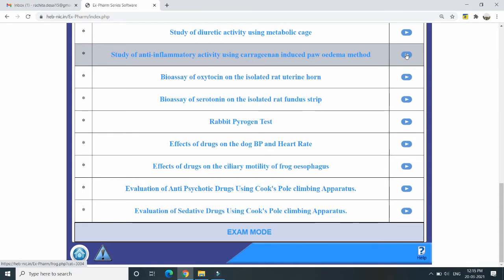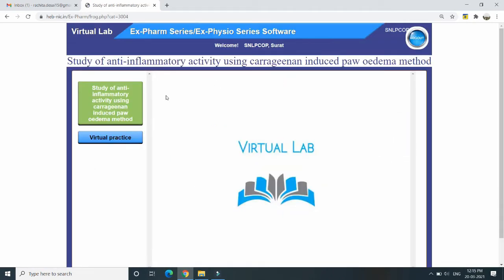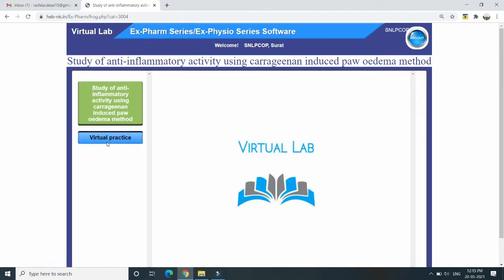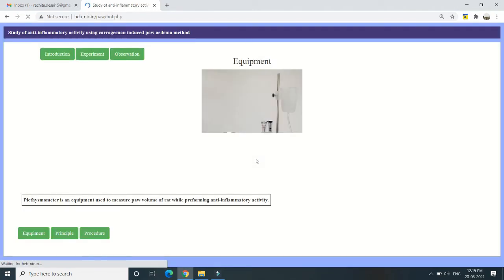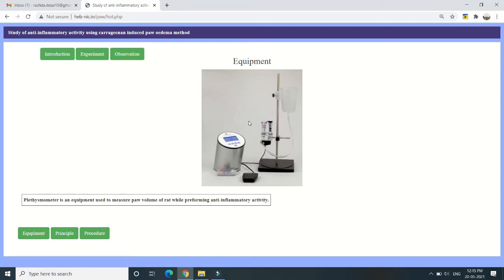You can do these practicals virtually as per PCI guidelines using this X-Pharm software. Today we will study the anti-inflammatory activity using carrageenan-induced paw edema method. Here you will get all the details once you click on virtual practice and start the experiment. As you can see on the screen, the equipment for the platysmometer is displayed. Two types of platysmometer are available — manual and digital. The one displayed is the digital platysmometer, where the volume is recorded digitally.